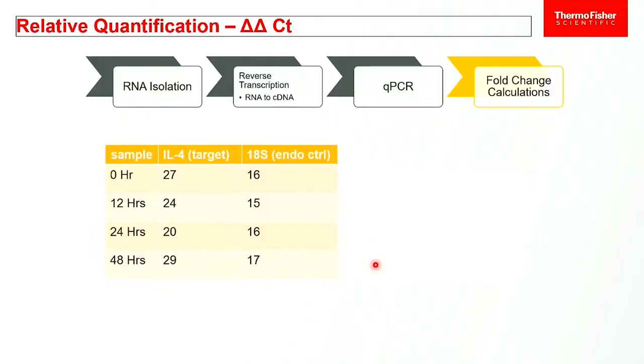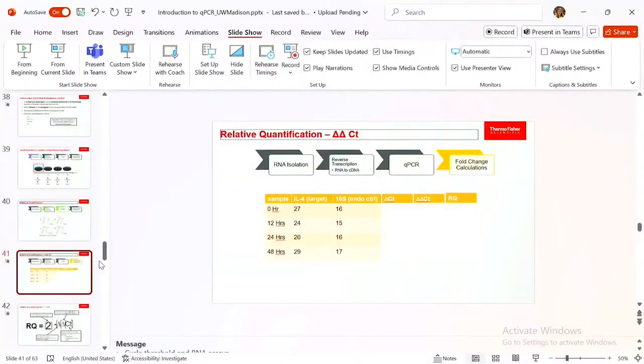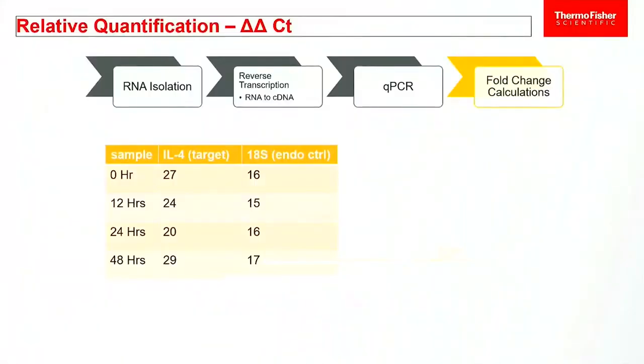Okay, so first thing we do is our delta-delta CT. All right, so first things first.